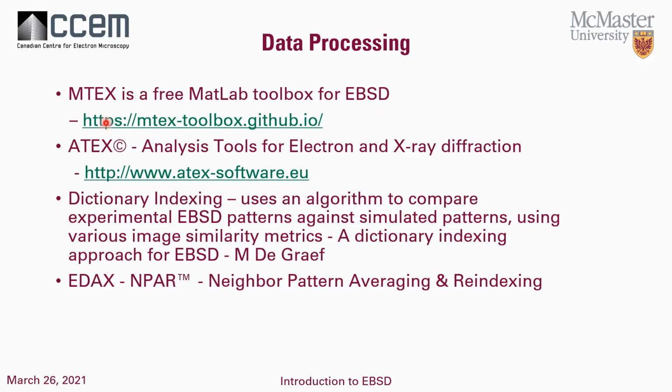And it's free, and they are doing development of new things and improving things there. So a very useful tool. In France, you have the ATEX software. I'm not sure about availability to industry, but for academia, there's usually no problem as long as they get acknowledged for the use of it.